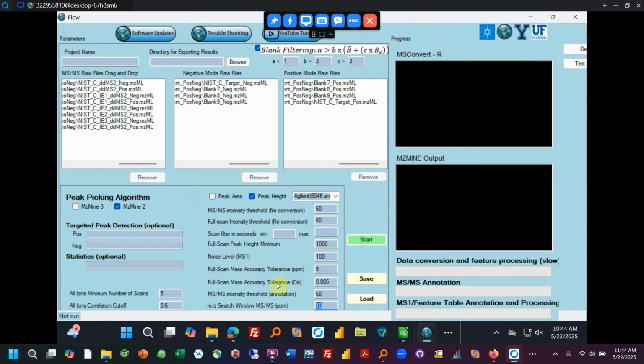It's a little confusing that we have both, but it is a good educational moment to realize what a tolerance and what a window is. In some software, they don't tell you whether the parameters are tolerance or windows, so you have to read or email them or guess. So at least here it's clear. And if you don't know exactly what a parameter does, you can scroll over, and for some of them, they will have tooltips that will describe that parameter.